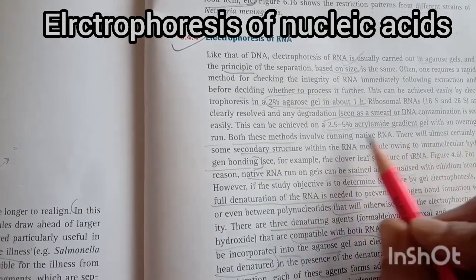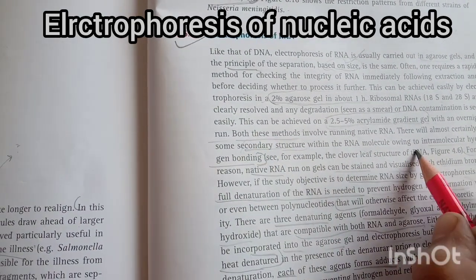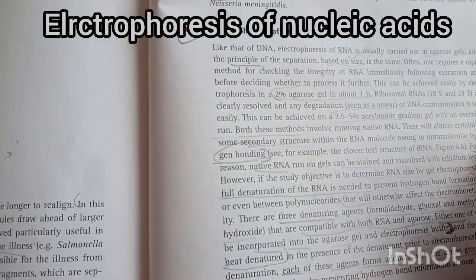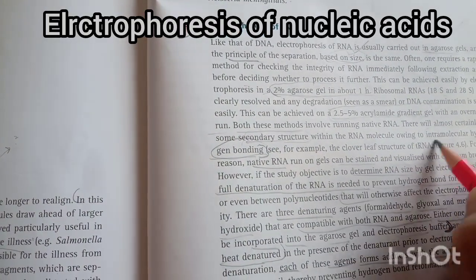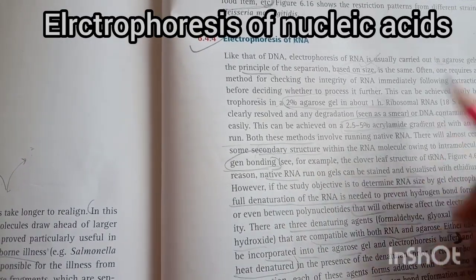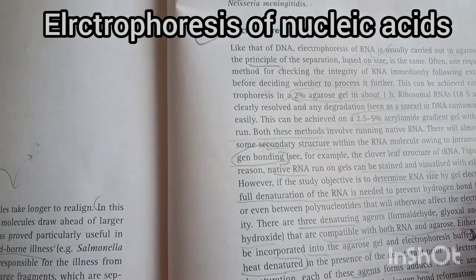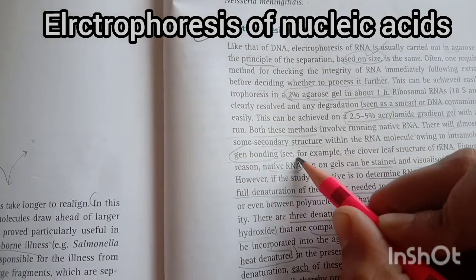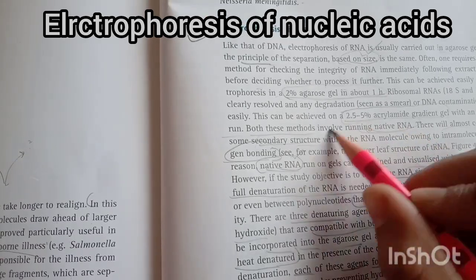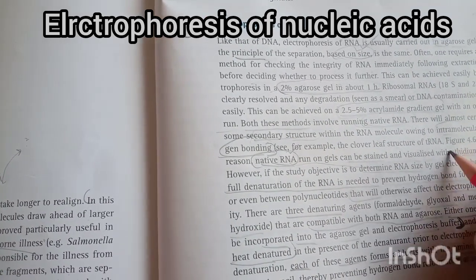So both these methods involve running the native RNA, so there will almost certainly be secondary structure within the RNA molecule owing to intramolecular hydrogen bonding. For example, there is a clover leaf, which we will see later on, in structure 4.6. So for this reason, native RNA run on the gel can be stained and visualized with ethidium bromide.